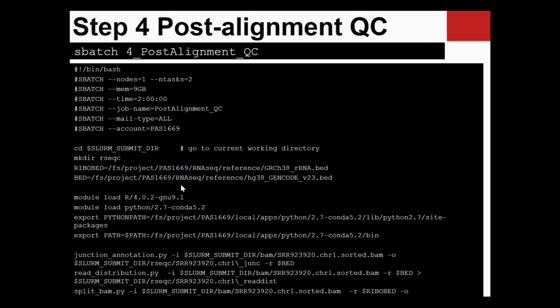This is just to tell RSeQC I'm interested in a list of genes. Those are the ribosomal genes, and I want to look at the contamination level of those genes. How many reads are aligned to ribosomal genes and how many are aligned to what we are really interested in, the messenger RNA.